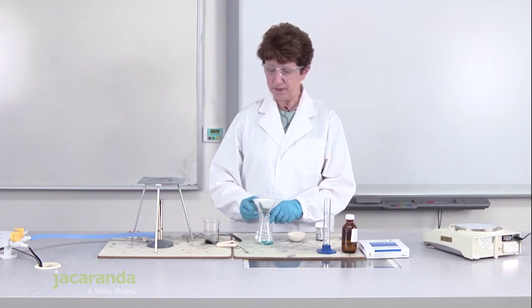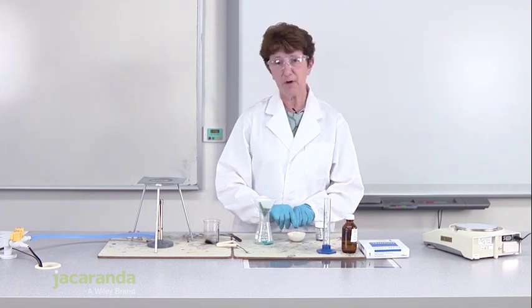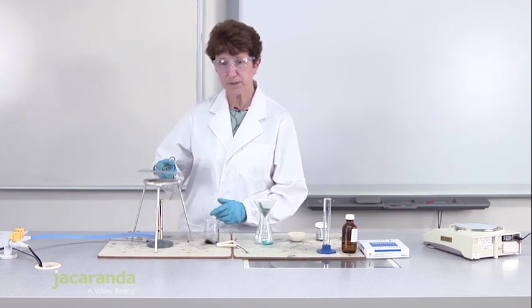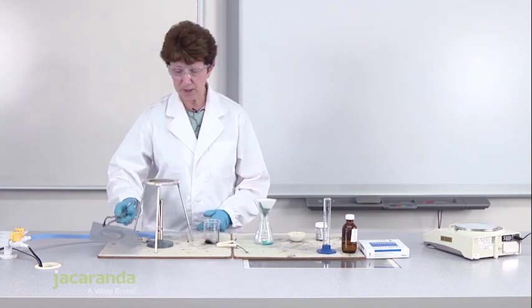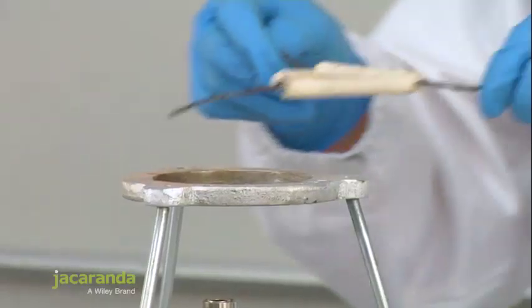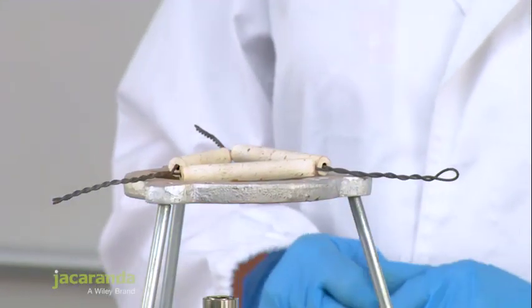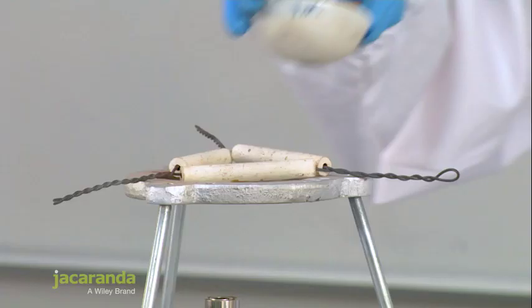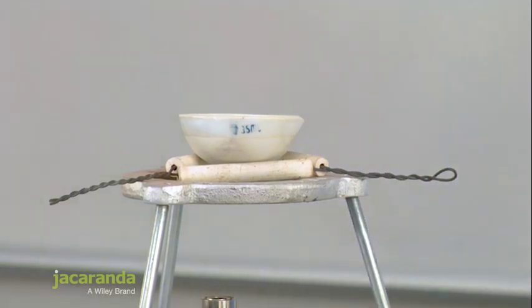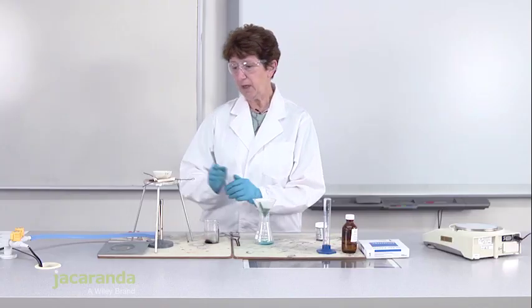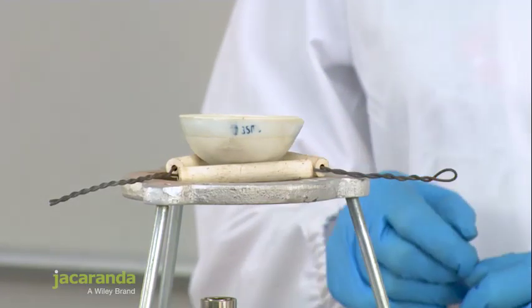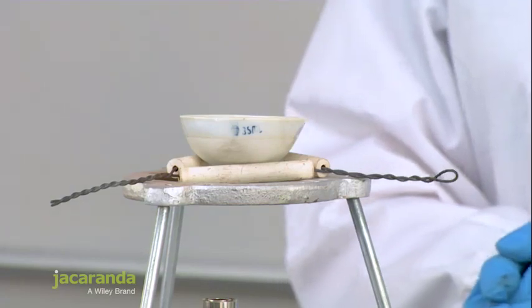After we've filtered that, we're going to pour it into our evaporating dish and evaporate some of the liquid off. We need to change our wire gauze and instead use a pipe clay triangle so that our evaporating dish sits neatly on top of the tripod. We're going to pour our filtrate once it's all gone through the filter paper into here and evaporate it a little and then leave it overnight and see what lovely crystals we've got at the end.